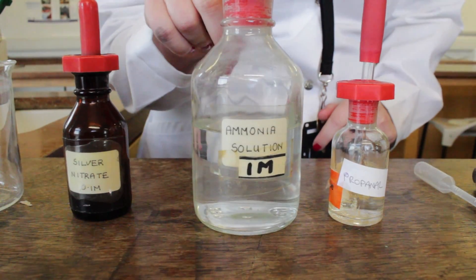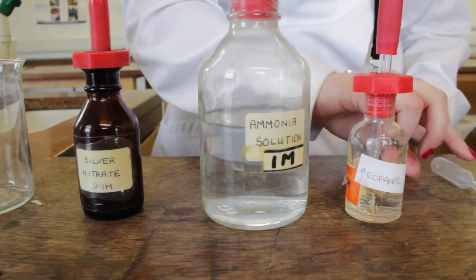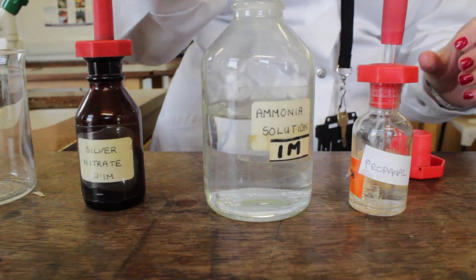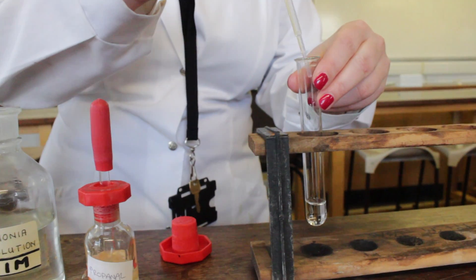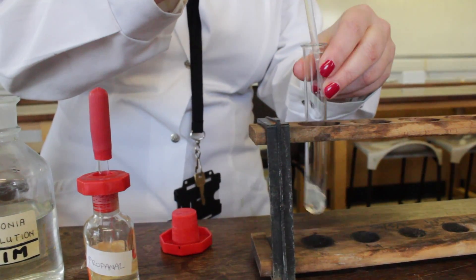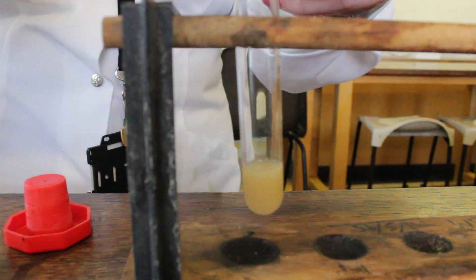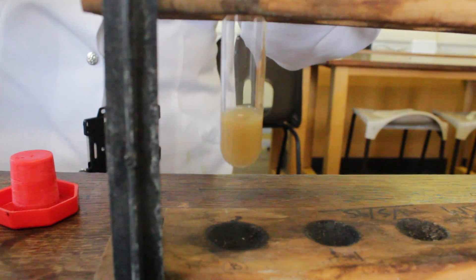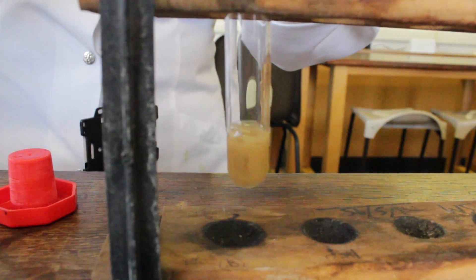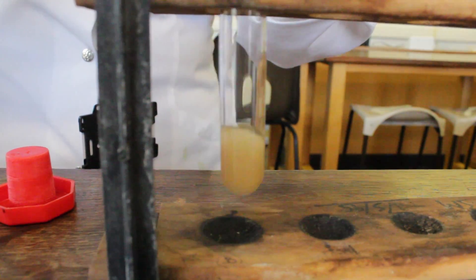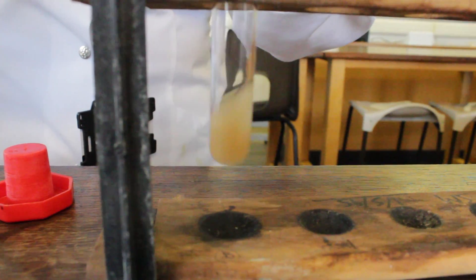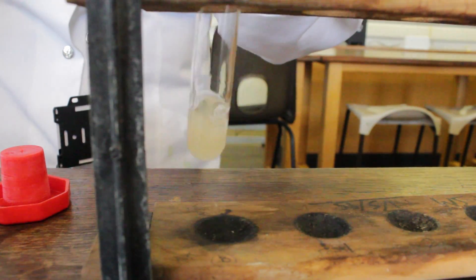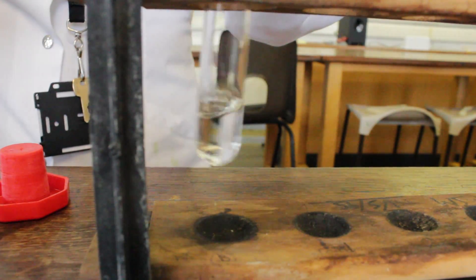We're now going to add the ammonia solution. It's important to add this drop by drop. As you add it drop by drop, give it a shake. You should see initially a precipitate of silver oxide forming. There we go, and then it disappears.